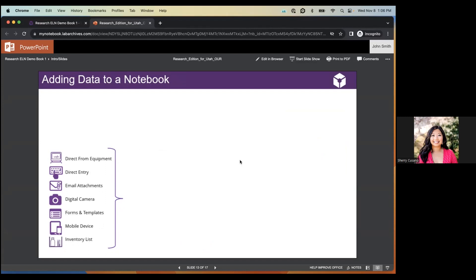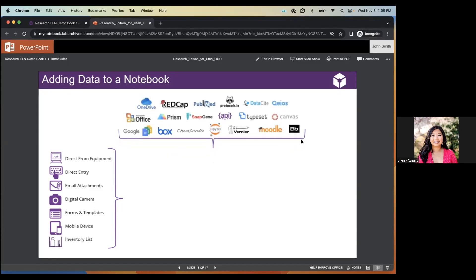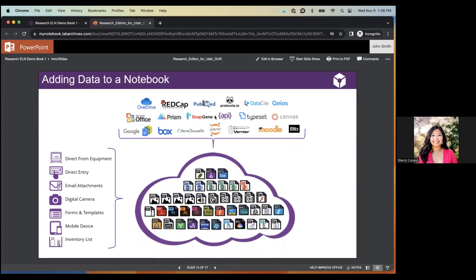Lab Archives isn't limited to browser entry — you can add data of any file type directly from your equipment, email attachments, or mobile devices. We have integrations with Microsoft Office, GraphPad Prism, SnapGene, and many others. Once your data is in your account, it's stored securely in our cloud and can be output in PDF and HTML formats.